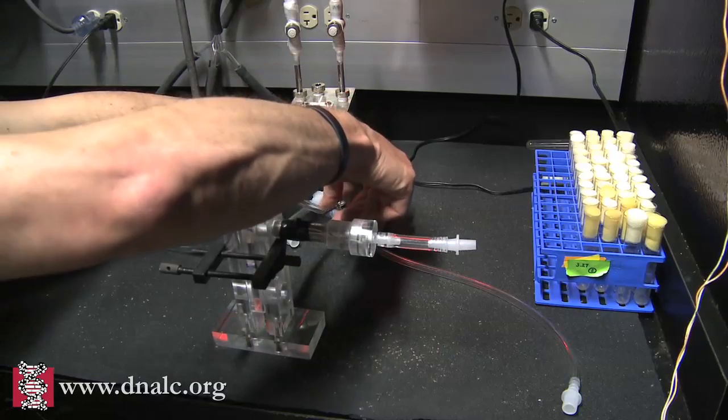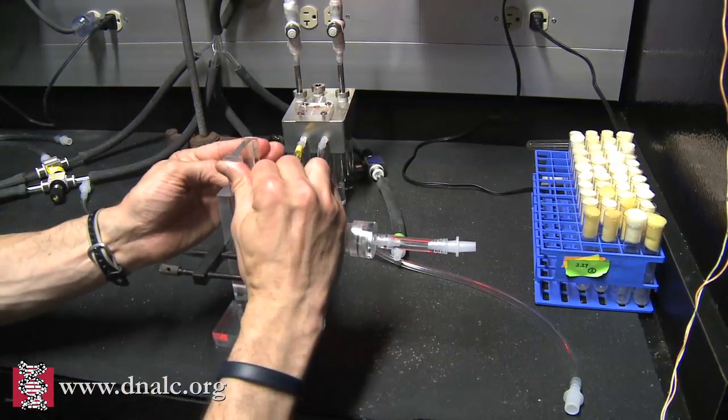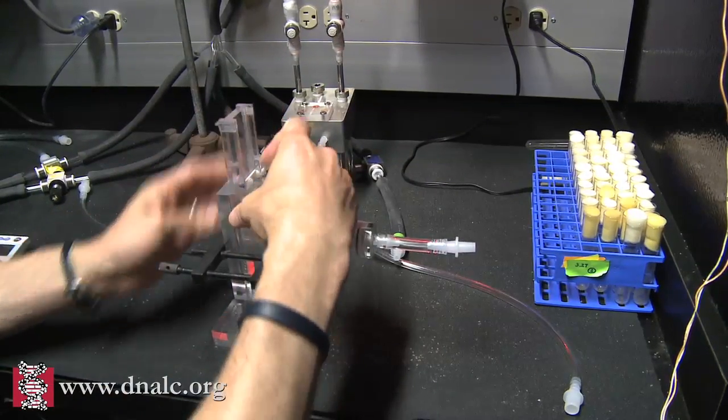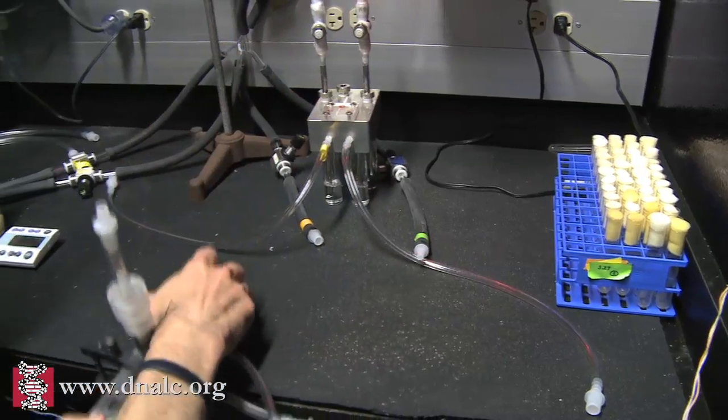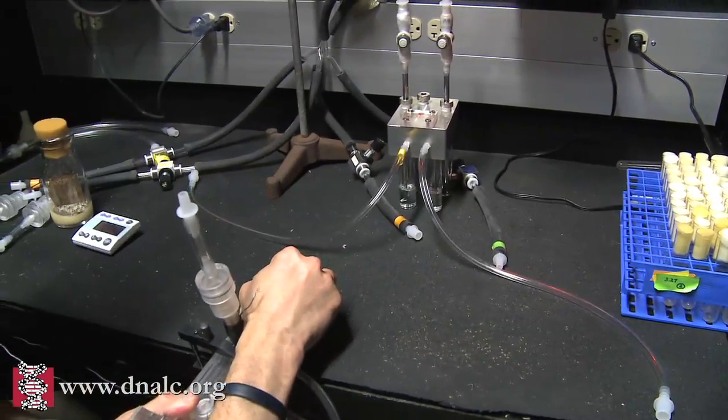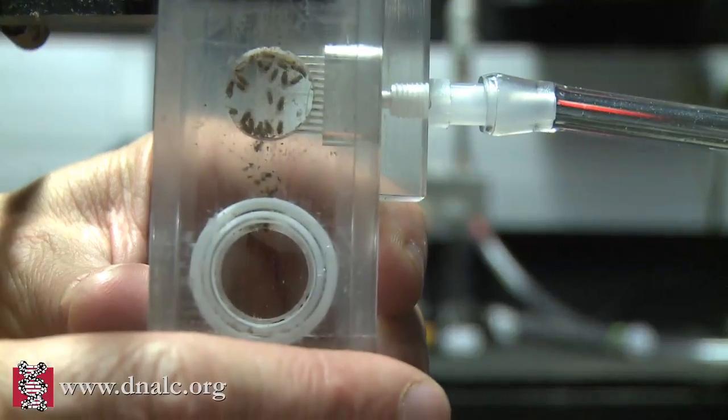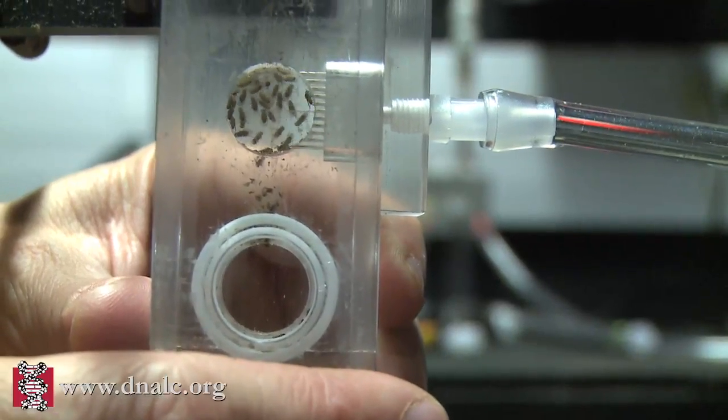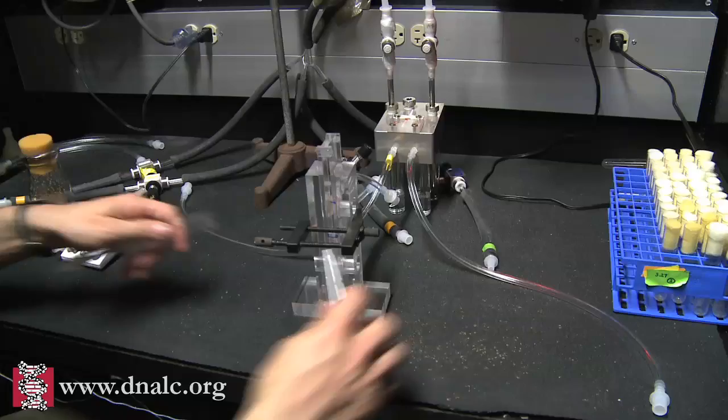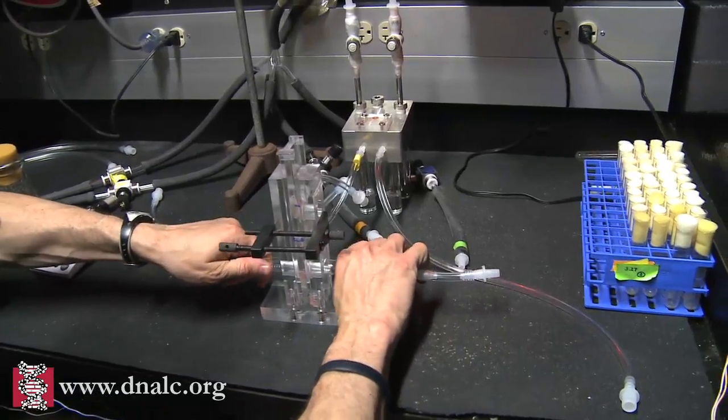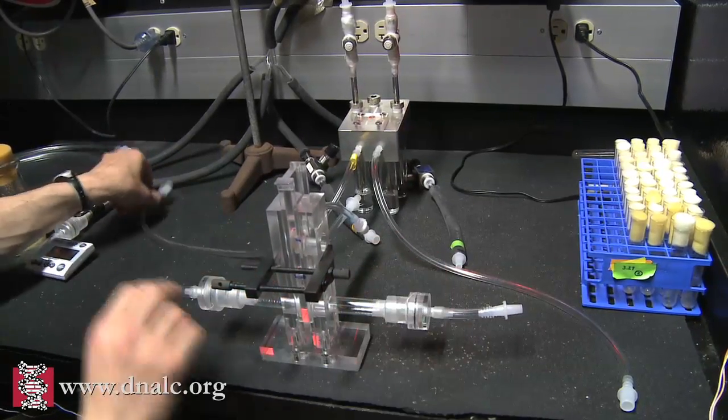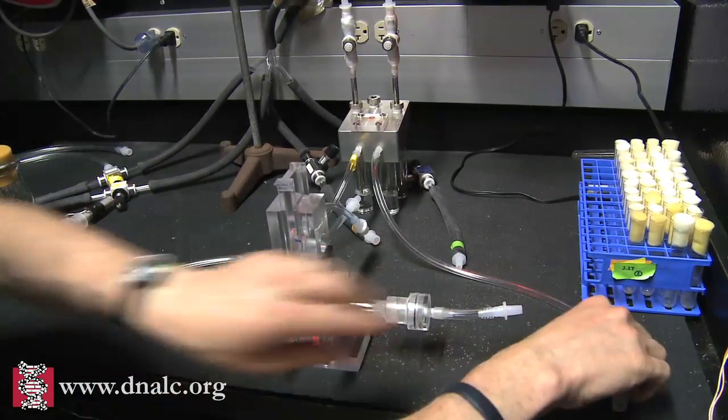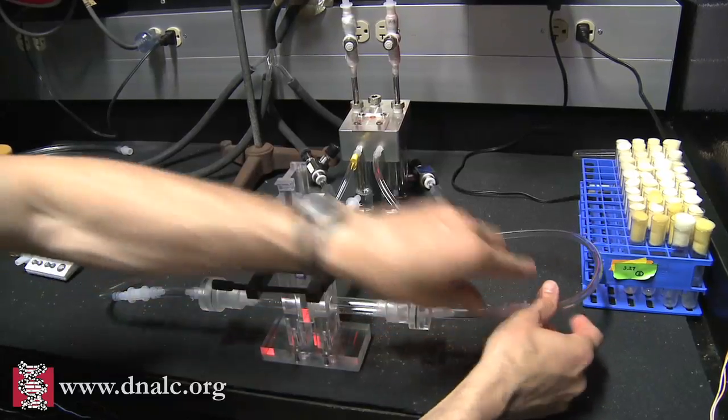After the flies have learned their lesson, we test their memory by transferring them to a little elevator. We do that by gently tapping them out of the training tube into the elevator. And now we attach the two arms of the T-maze. The left arm is going to get OCT, and the right arm is going to get MCH.